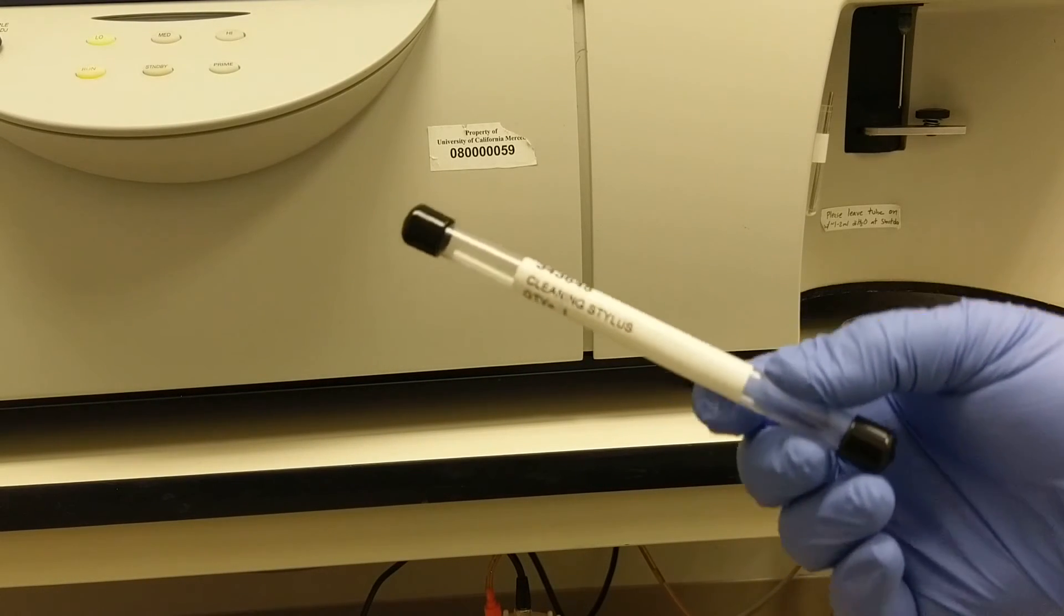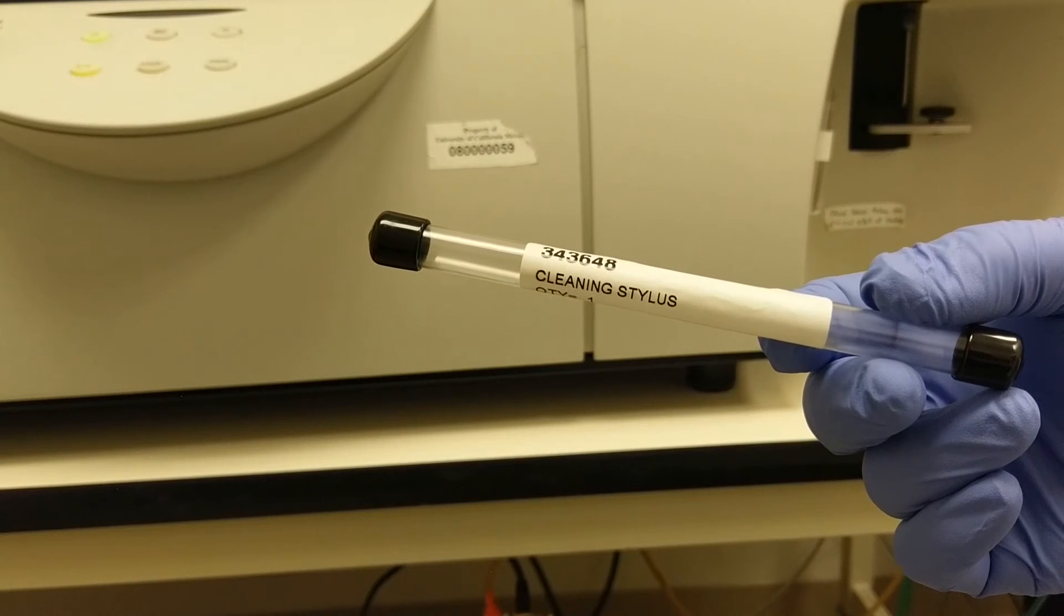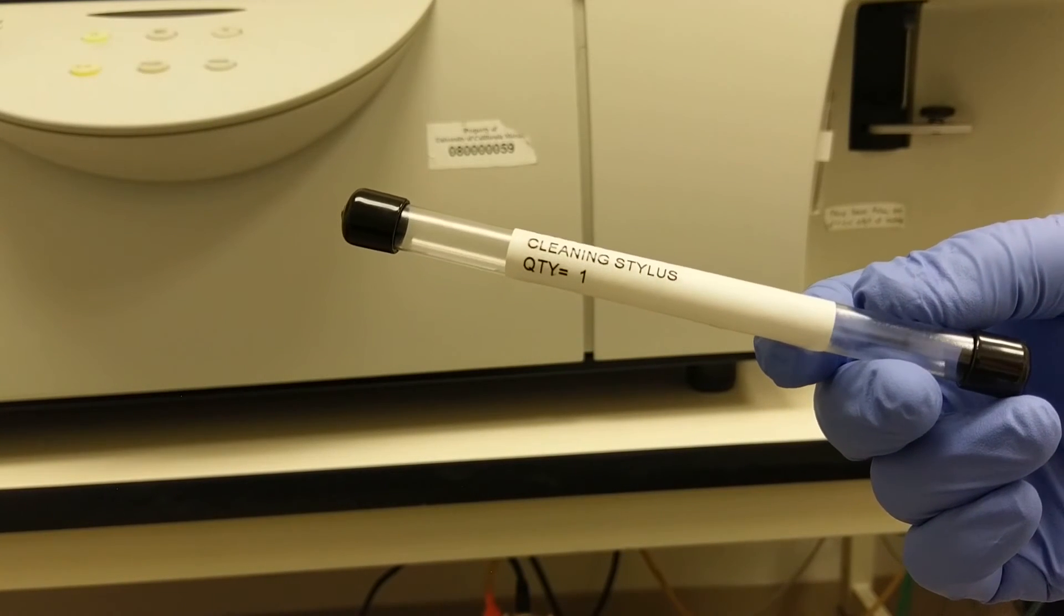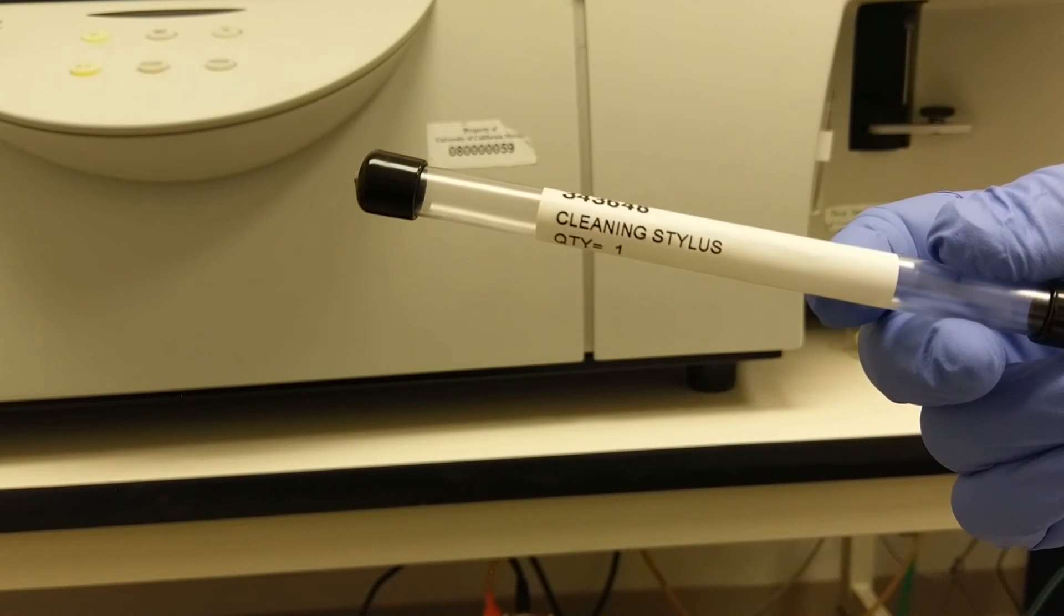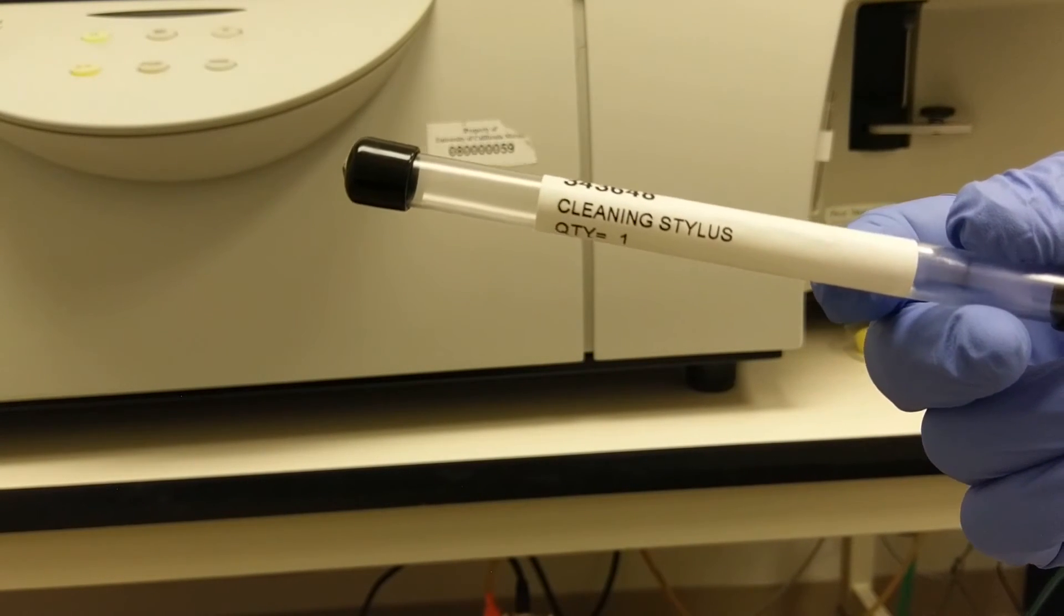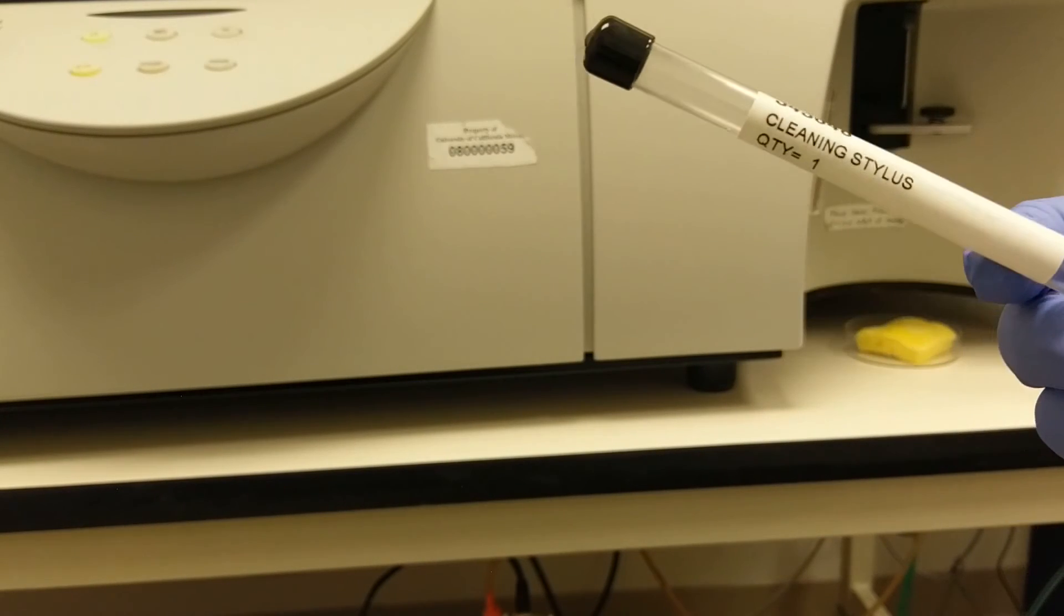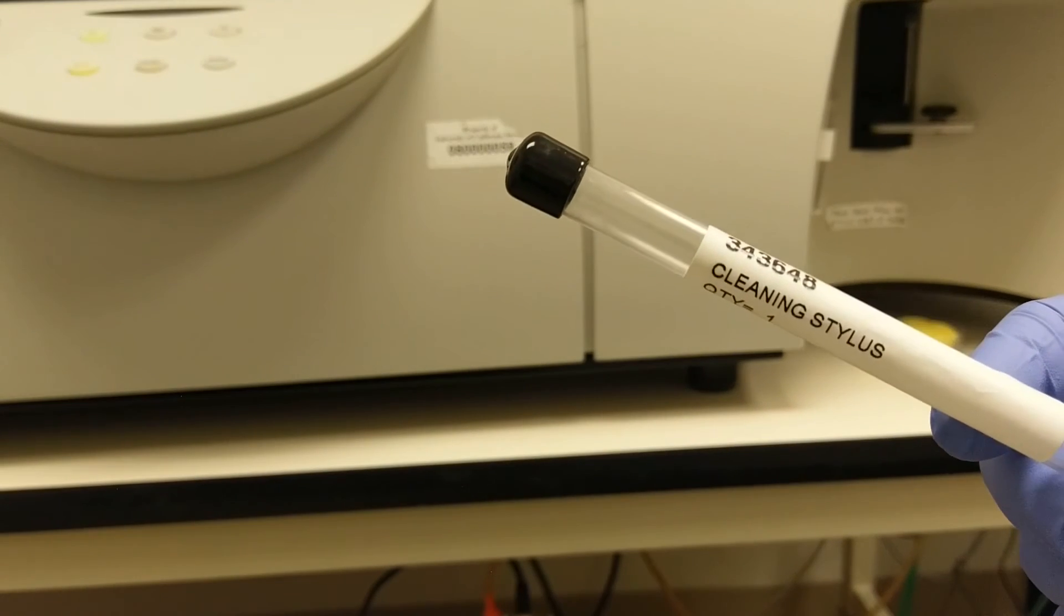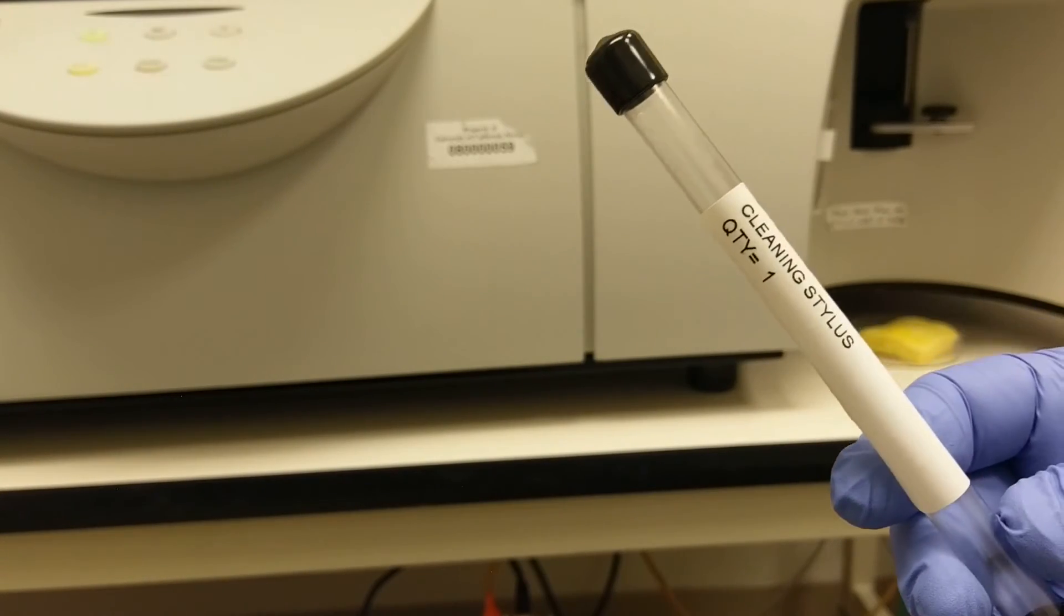If pushing with this syringe is not working, the last sort of line of defense is these fine wires called cleaning stylus. And both the cleaning stylus and the syringe with tubing can be found in the drawer underneath the LSR. The cleaning stylus is kind of the nuclear option, and I would not recommend doing it unless you were trained on doing it.